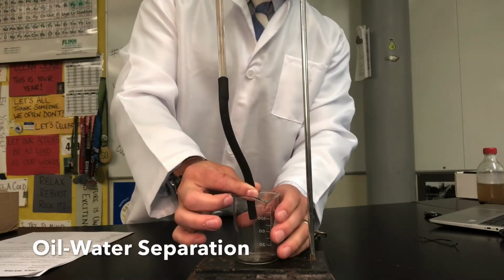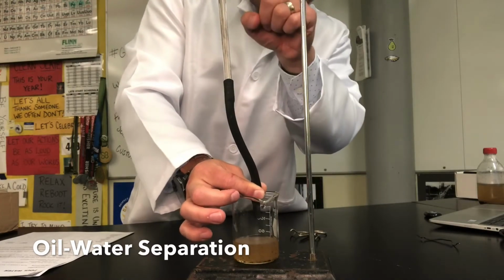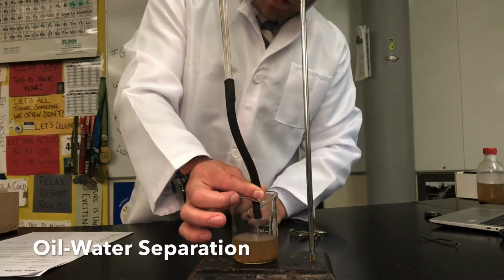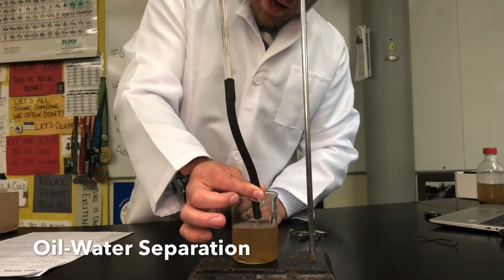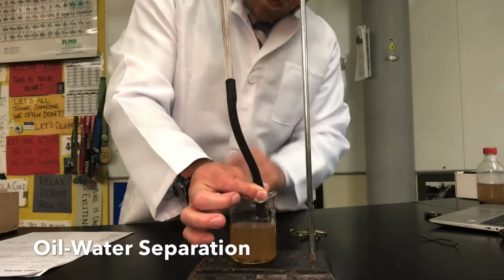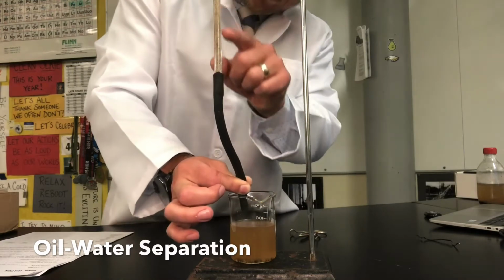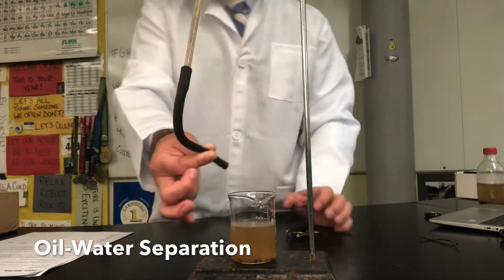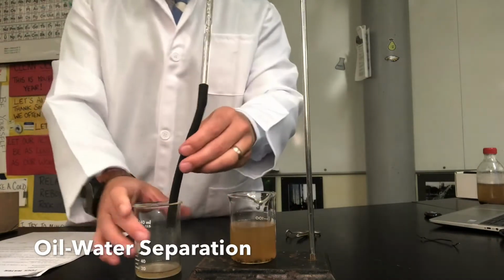So you can see I'm gonna slowly let the water through, it's draining in here. But while I'm doing that, I'm keeping an eye on where my oil layer is. I don't wanna let that out into my water sample. So I'm gonna slowly drain, slowly drain, slowly drain. And now I'm getting towards this layer of oil. So I'm gonna be really careful not to get any of the oil in there. All right, and now you can see the little globules, or little spheres or circles of oil. I don't want that. So I'm gonna take another beaker and empty that oil out into another container.